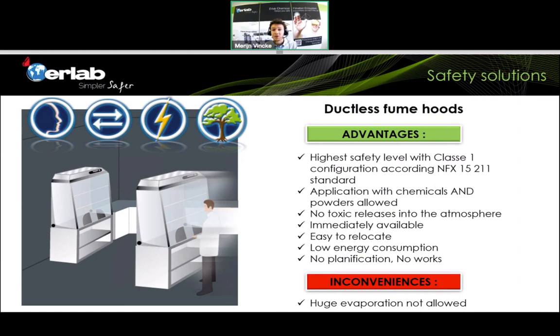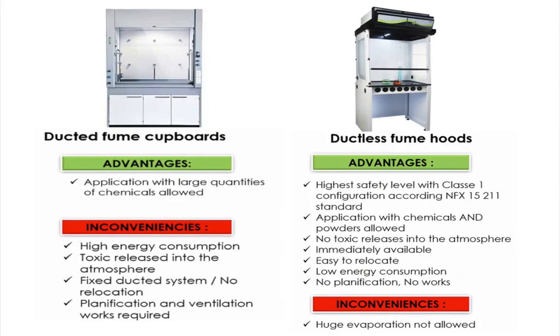The only inconvenience of a ductless fume hood, and that's why risk assessment again is so important, know exactly what you're doing in those hoods, is the fact that huge evaporations are not allowed, because otherwise the carbon filters will be saturated very quickly, and then we cannot guarantee the safety of the people working with the chemicals.